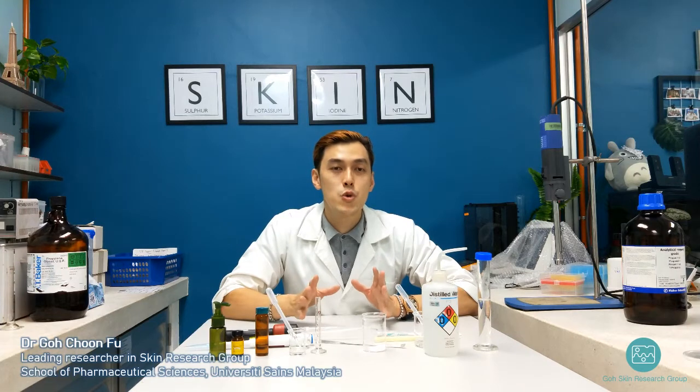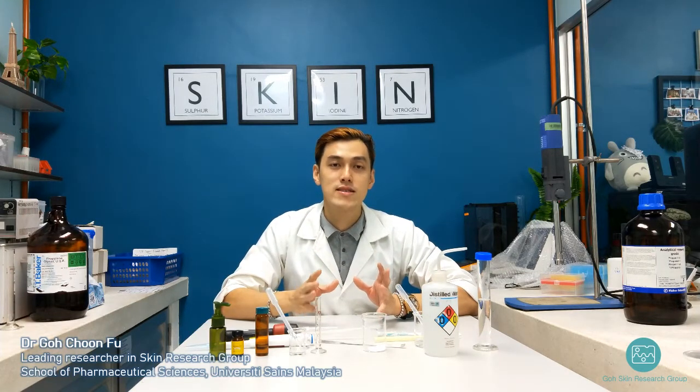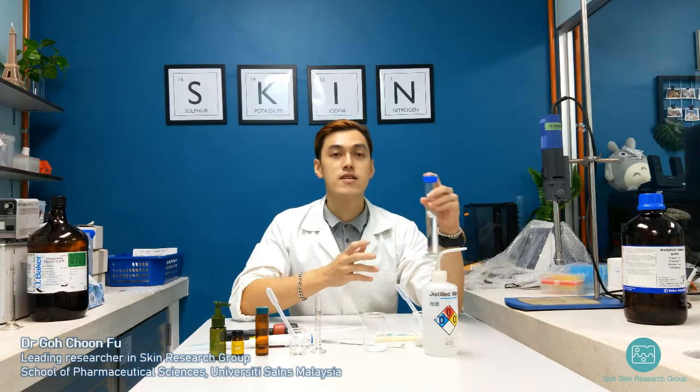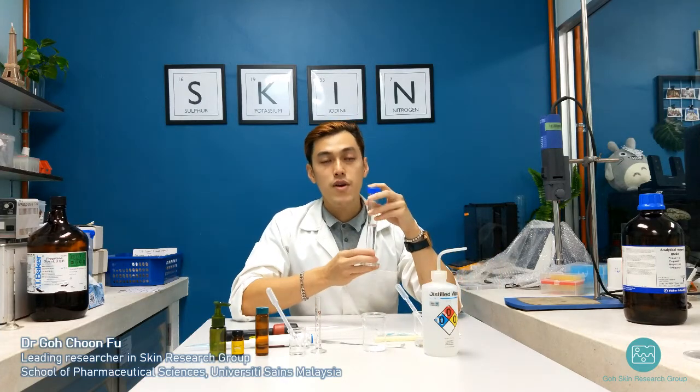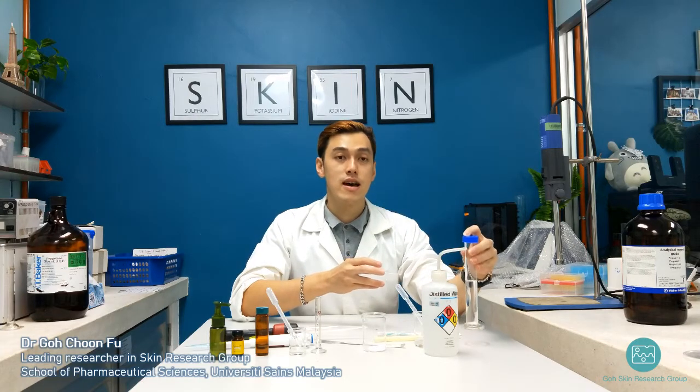Today I'm going to show you how to prepare your hand sanitizer gel, or hand sanitizing gel. As we mentioned, we need to sanitize our hands, so the major ingredient we have here is alcohol. Over here I have isopropanol, or else you can also get ethanol.